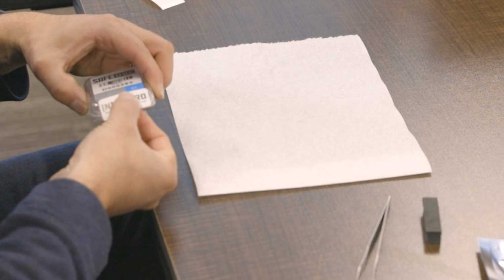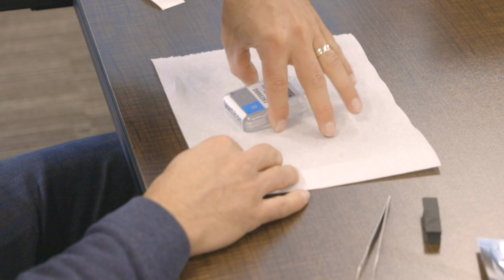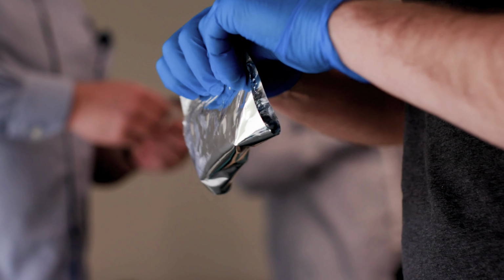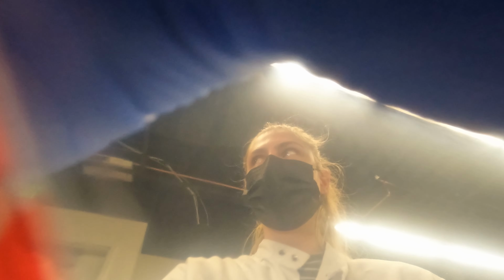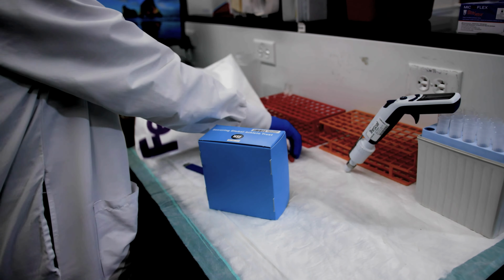In less than 2 minutes, the full DBS cartridge is transferred into a tamper-evident DBS security kit from another private partner, a company called Innovero. The kit is then sent off to the lab. With experience, researchers have established an efficient DBS workflow to open the secure DBS kits and process samples through the lab for analysis. It's not much different than a urine sample. The samples will come in just as normal through some kind of shipping organization. We'll log those samples into our system.